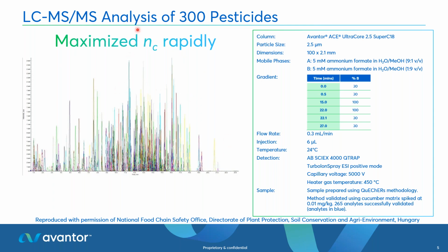For example, here we showcase an analysis of 300 pesticides. And hopefully today you can have some insight on how to maximize the sample peak capacity in a rapid fashion.